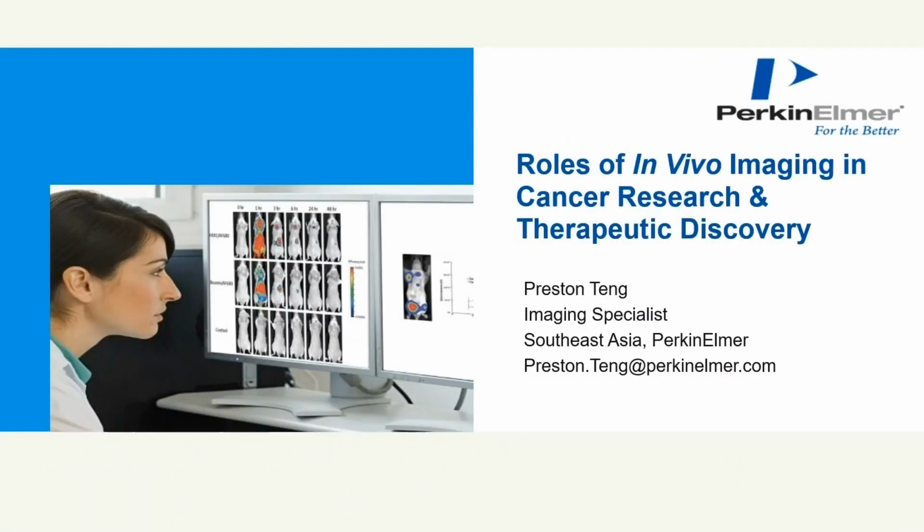Moving on to in vivo imaging, here's an overview of the presentation, in which I will introduce the concept and applications of optical in vivo imaging using mainly mouse models. And optical imaging can be divided into two broad categories: bioluminescence and fluorescence imaging. And PerkinElmer offers some examples of how optical imaging can be applied to study and understand different aspects of disease biology.